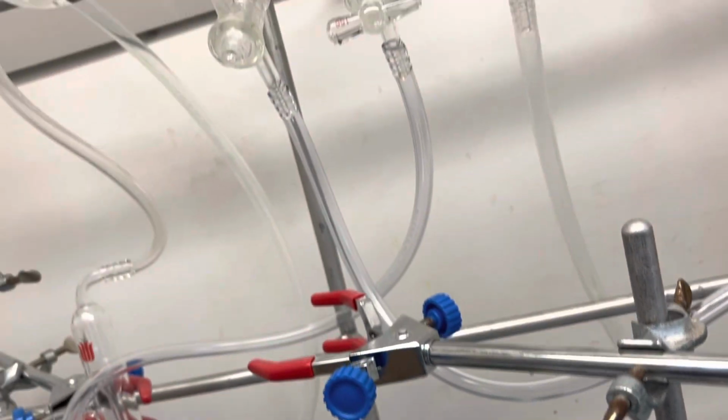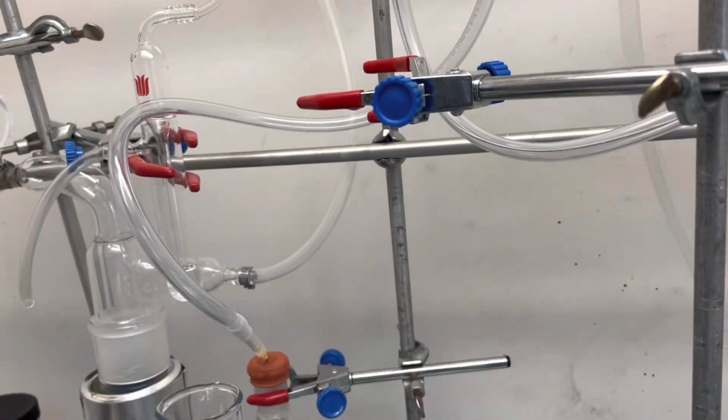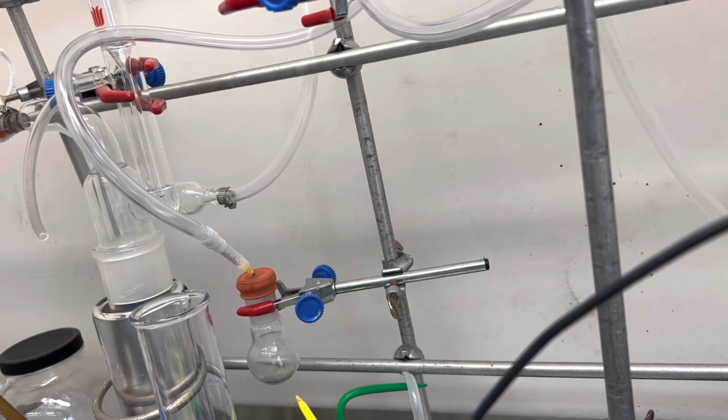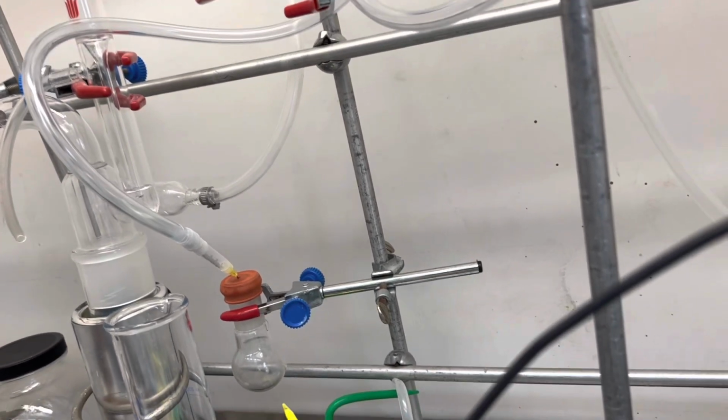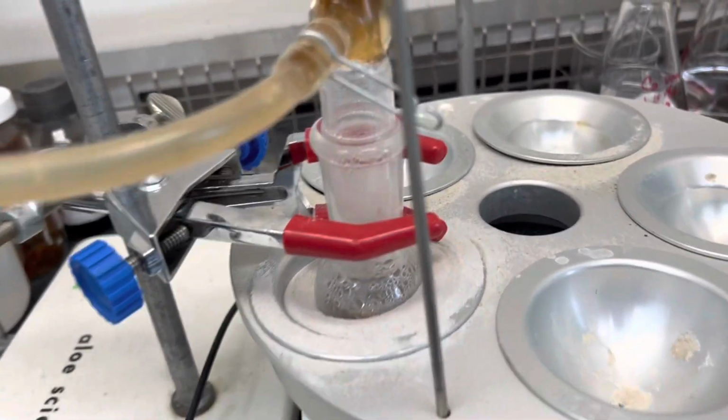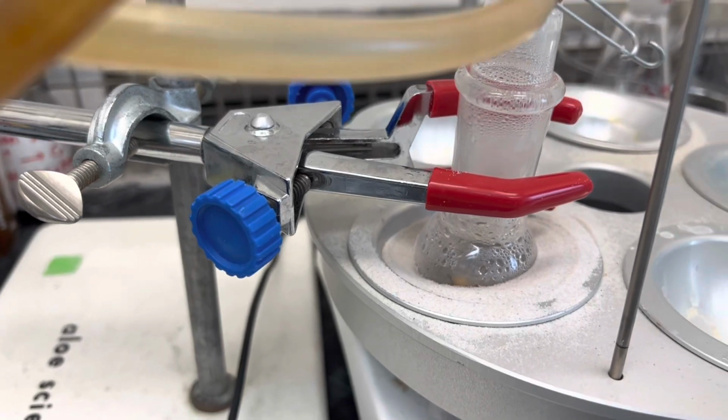After 1 hour I will just cool down the reaction, and then I will add saturated sodium bicarbonate solution, and then I will extract with ethyl acetate. And that's it. That will be the reaction crude, and then you can either recrystallize or purify through column chromatography.